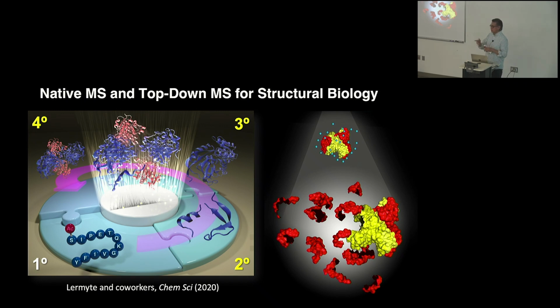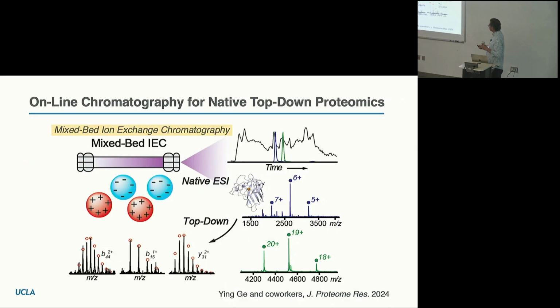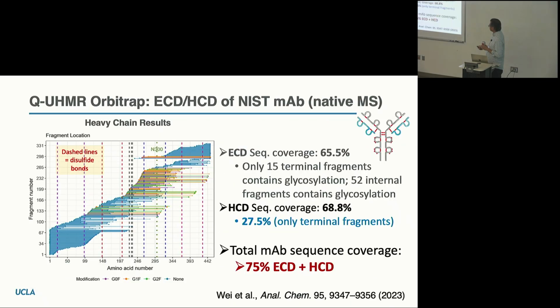Questions? Yes? So I was really interested when you showed the antibody that you cut and were able to increase the sequence coverage. So I'm not 100% clear why that makes such a big difference. You're basically cutting off the epitope. No, the epitope. Oh well, there's no epitope. I mean, there's no epitope bound to this. So it's just the antibody.